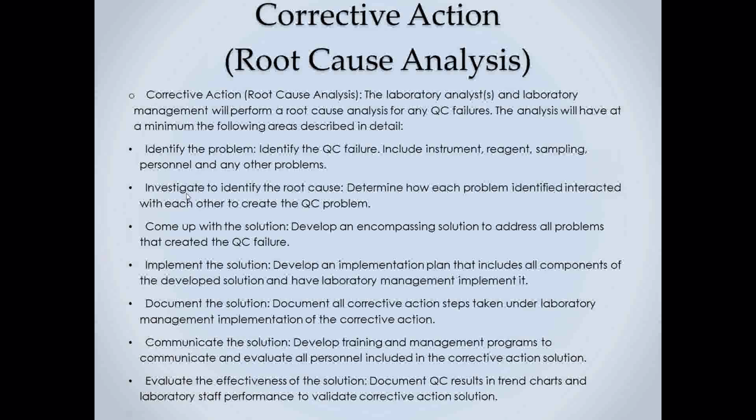Rerunning the analysis is not coming up with a solution. Implement the solution so you don't have a repeat on this. Document the solution. Communicate the solution. Develop training and management programs to communicate and evaluate all personnel included in the corrective action solution. And then evaluate the effectiveness of the solution. So just rerunning the analysis, at least in this method, is not the root cause analysis.